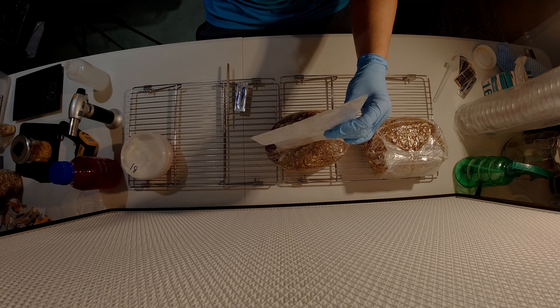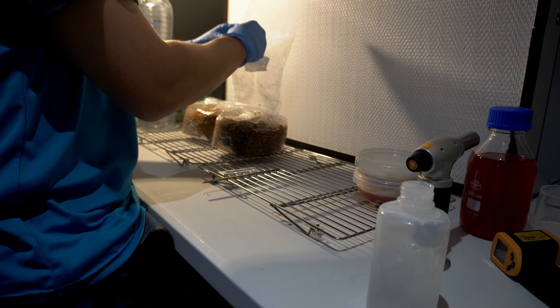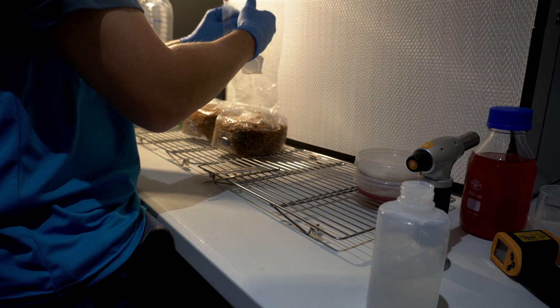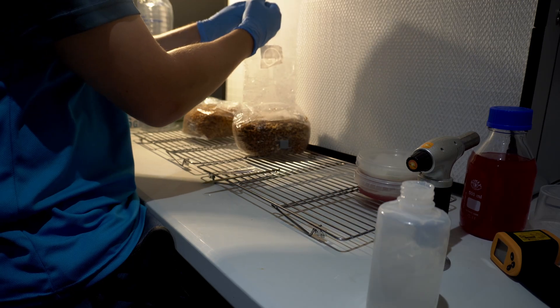To begin with, carefully open your sterilized grain bag by pulling it apart from the outside to create an opening. If you're working in a still air box, avoid making such a large opening to minimize movement and minimize contamination risk.